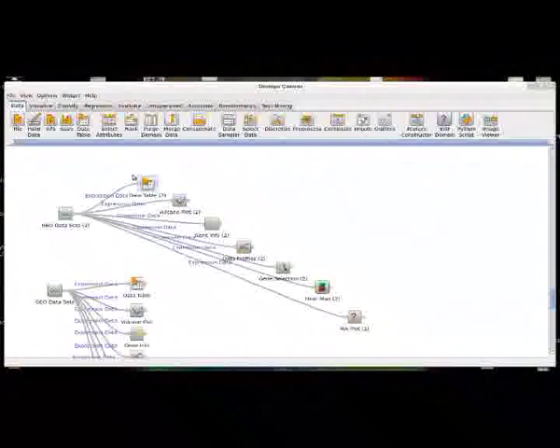So I can't tell you anything interesting about that offhand, but if you're a bioinformatic researcher, little things like this are why you're actually playing with this data.